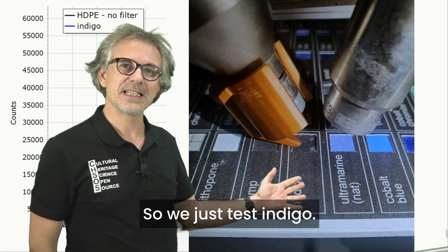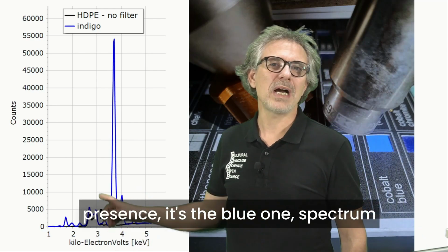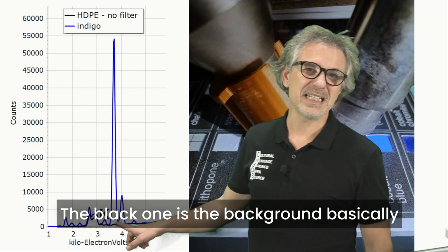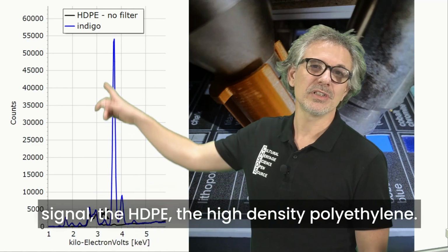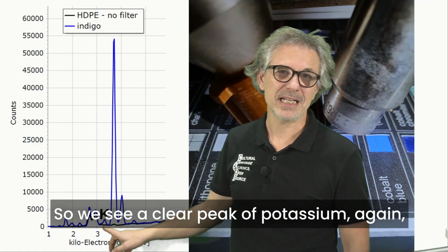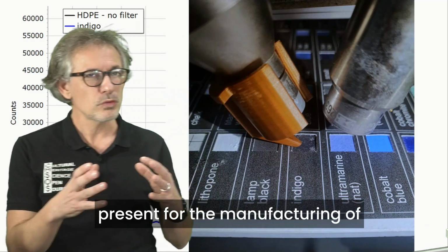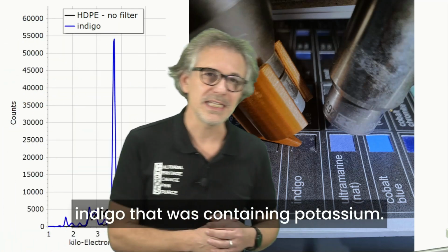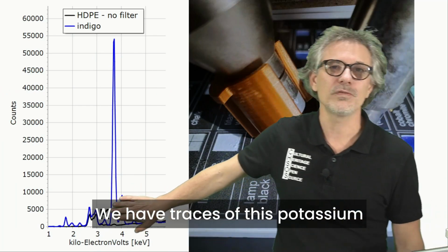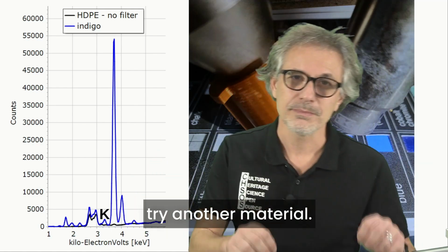So we just test indigo, and from indigo we see the presence, the blue one is the spectrum, we see the peak of potassium again. The black one is the background signal, the HDPE, the high density polyethylene. So we see clear peaks of potassium. Again, this is indicative that there was an alkaline solution containing potassium present for the manufacturing of indigo. So we have traces of this potassium over here in this peak. Let's go in the lab and now we try another material.